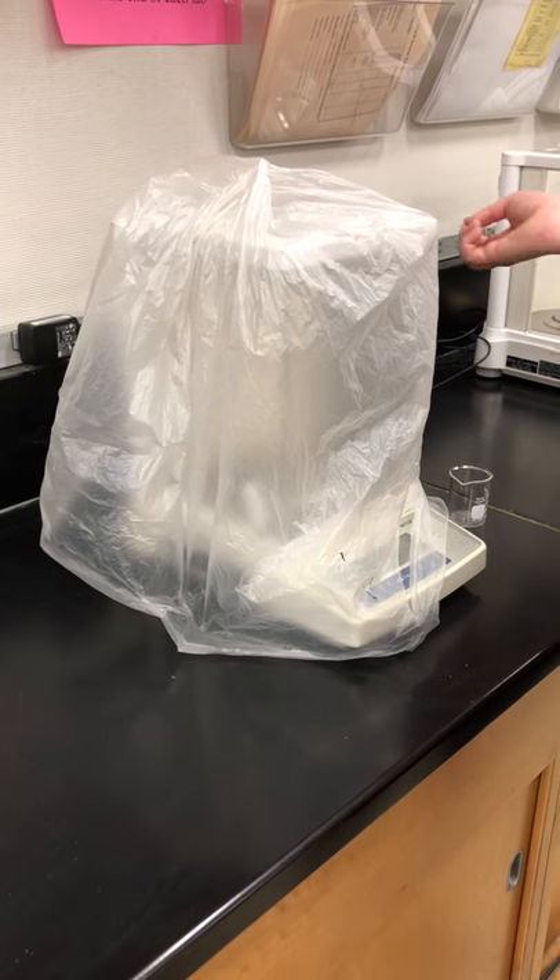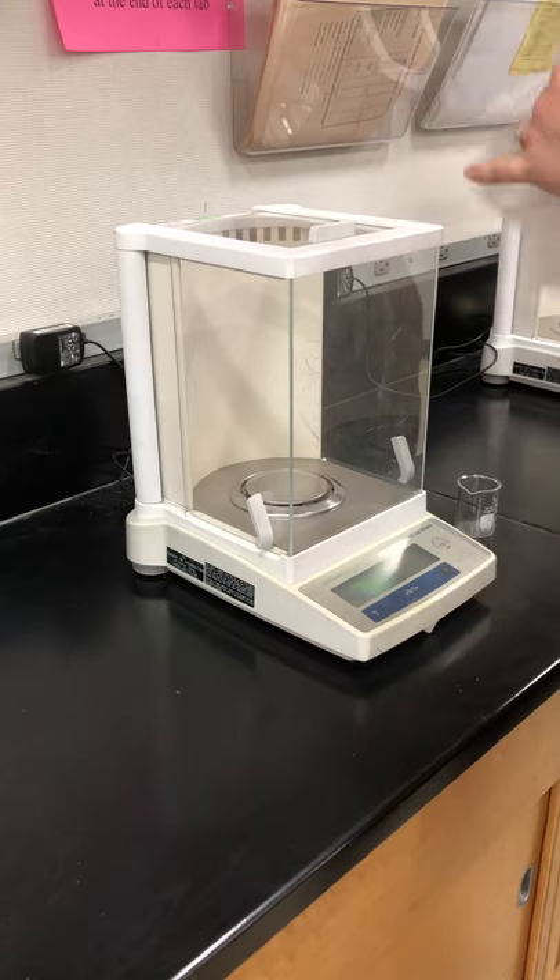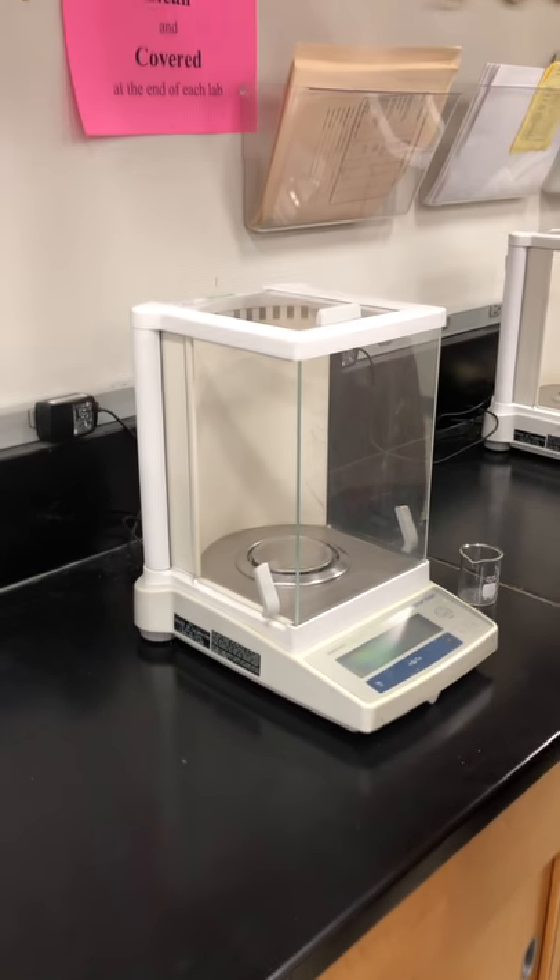Today we're going to talk about how to use the balance. The first thing you want to do is remove the plastic cover and store it away from the balance.